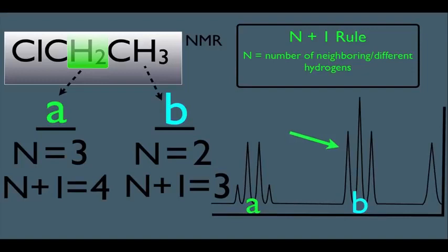So I want to point out here, it's important, we can look at an actual organic molecule and predict not only how many signals will be in the H-NMR, but how the signals should be split up. We're going to see later on that this is extremely valuable information. So for now, just please take my word that this is a valuable skill, and let's look at some examples to try to really get this skill down.